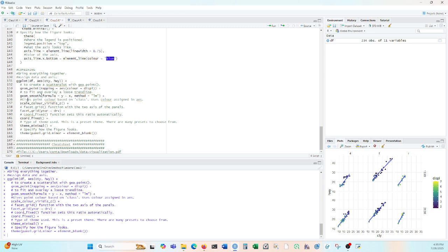And then we have the geom_smooth with the formula, which is just a line, which all of them have. And then you have the scale of what the color should be. You can see there they have a various scale. And then the facet_grid, which is very obvious. They're all in facets based on year and drive.